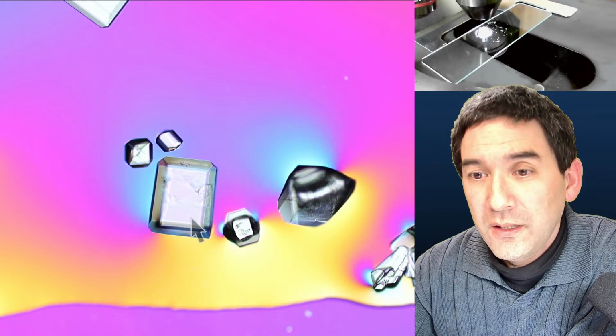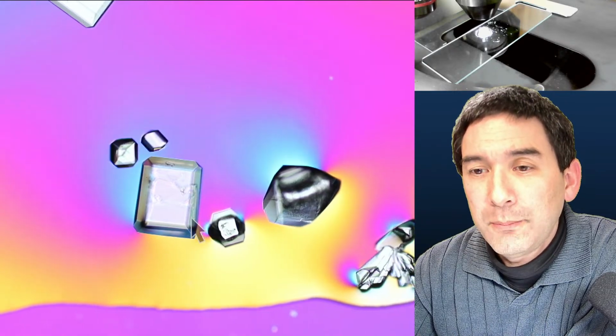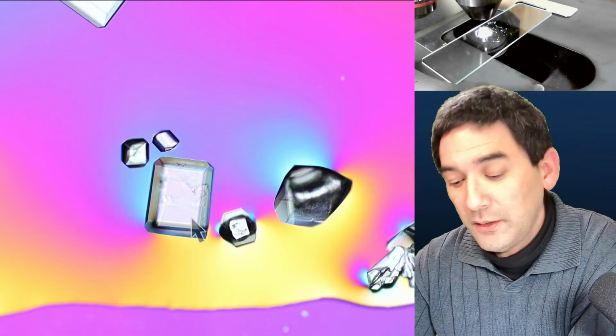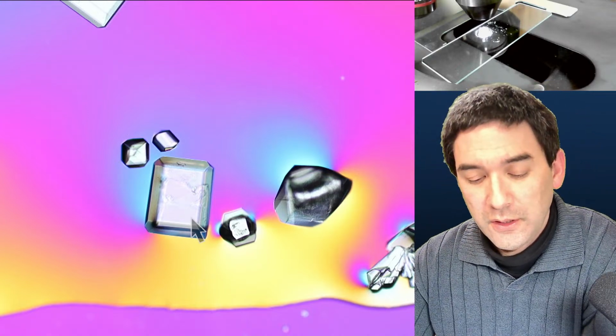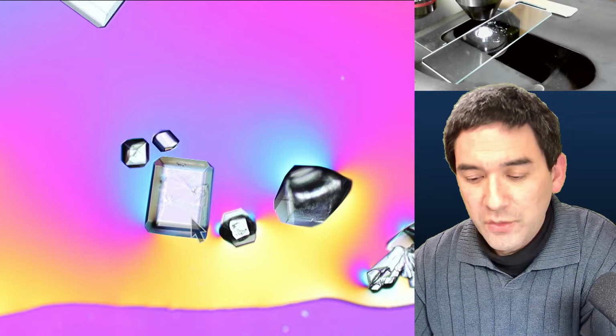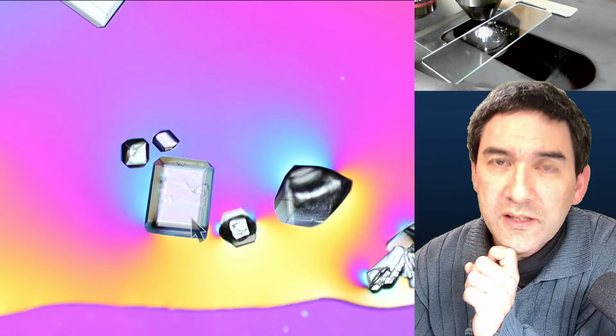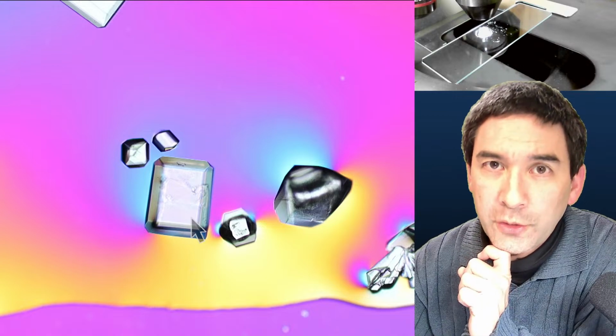Okay. Why are there so many air bubbles in the potassium carbonate? I think that's a good one. I can actually show it to you briefly as well. I think it could be that maybe the potassium carbonate starts to break down, also forming carbon dioxide.